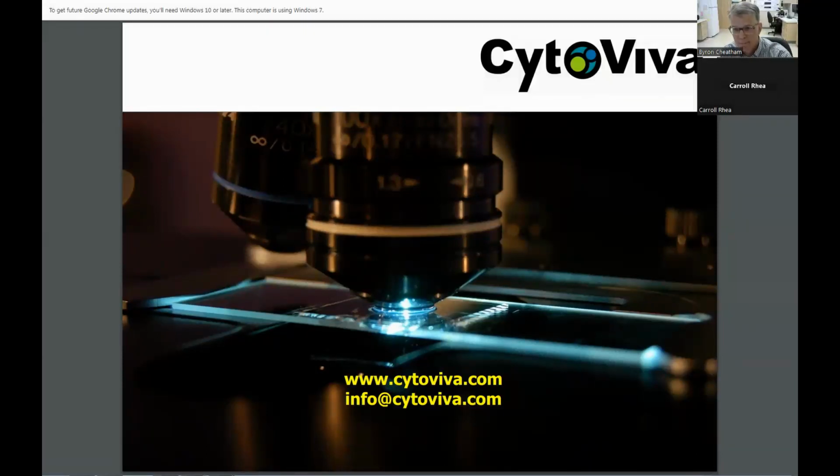But also there have been papers published. Dr. Rebecca Drezek's lab at Rice University was one of the first that comes to mind, where she was able to demonstrate that the biocorona effect of the cell is different on the nanoparticle in different areas of the cell. Now, this was a highly complex methods paper that she produced, but it demonstrated that capability to know that they're not only not on the membrane, but inside the cell, but in different subcompartments of the cell.